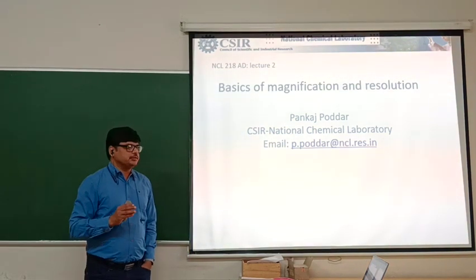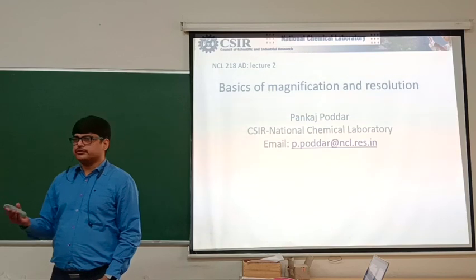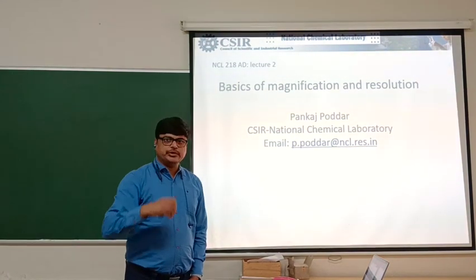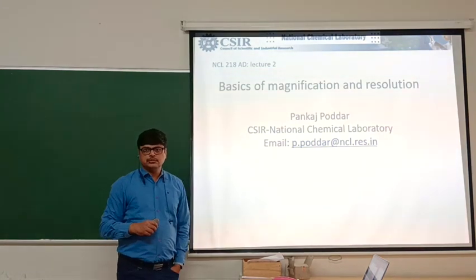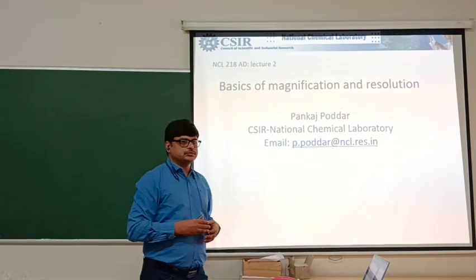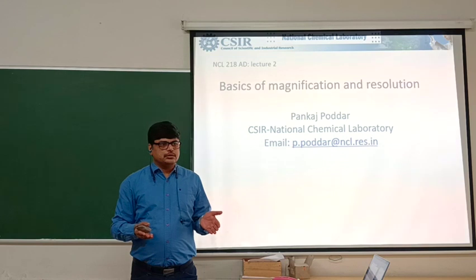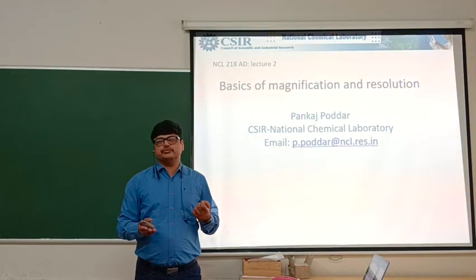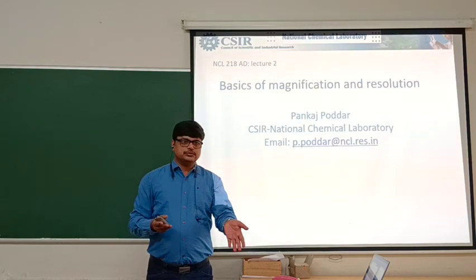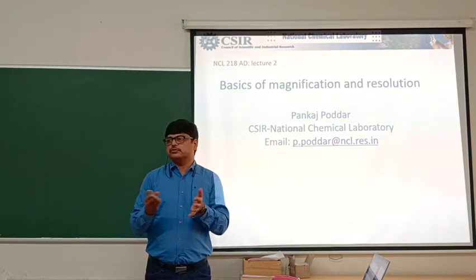So the principle is that this becomes relevant because we'll be talking about high resolution TEM, which is there at NCL. Yes. And it's most sought after, right? Dinesh is quite a senior student. So it's quite important for your research, right? High resolution TEM? Yes. So high resolution TEM does not mean that you keep on magnifying and then you reach higher resolution, right? It's an empty resolution. So it's a fake resolution, right? That's why you need to connect with the idea of pixel through that question number 1. Your mind will get connected to the idea of pixel, right? It does not make any sense if there is no information there.